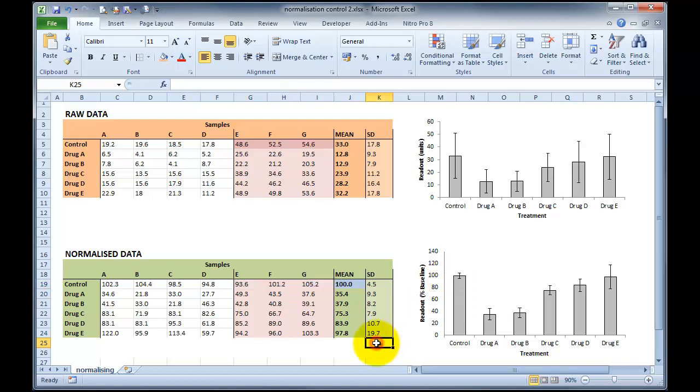So I hope that explains how this kind of normalisation, so normalising to a mean, is often a good way of normalising your data.